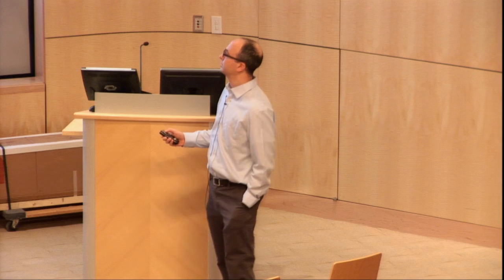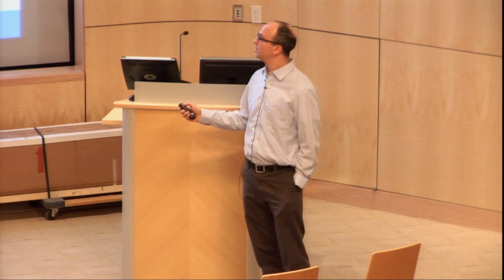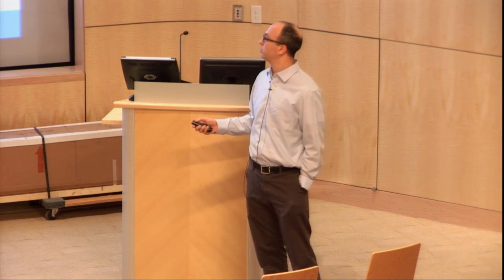Okay. I'll touch very briefly on spectral counting. So the mass spectrometer is a sampling instrument. It has to sort of pick peptides that it's going to sequence on the fly. It picks a precursor, fragments it, and reads it out. But it's not comprehensive. We don't sequence all of the peptide peaks in an LC-MS experiment. We leave some behind. We know that because if we redo the same sample multiple times, we find new proteins. So we know that we're not comprehensive, but still, your likelihood of sampling a given peptide or a peptide from a given protein is tied or somehow proportional to its abundance.